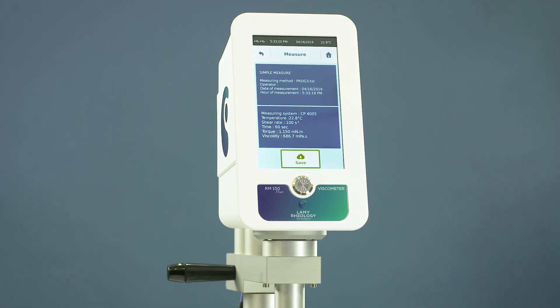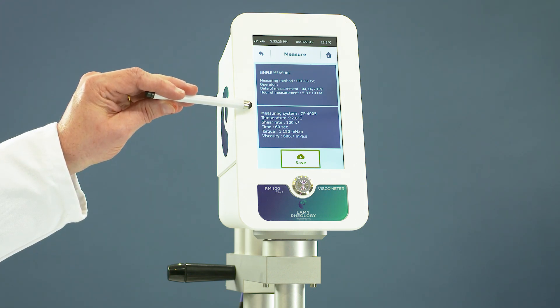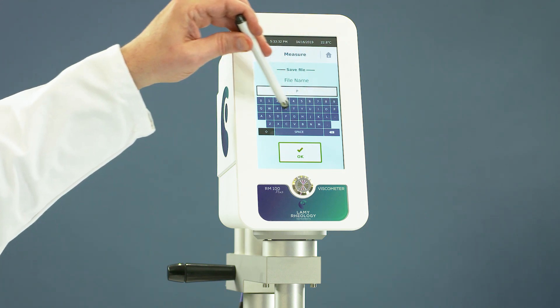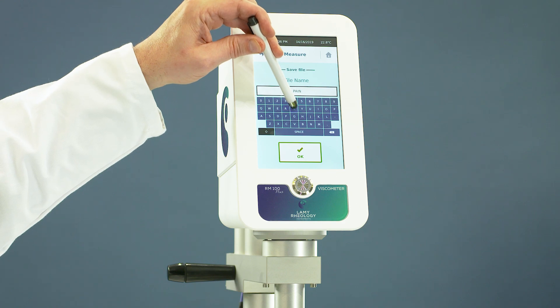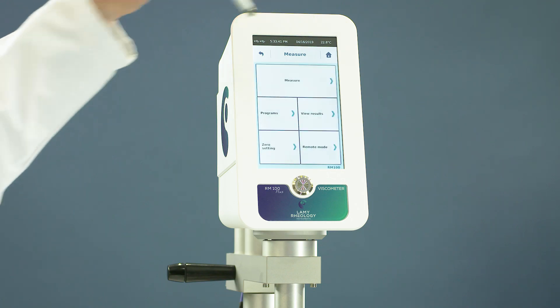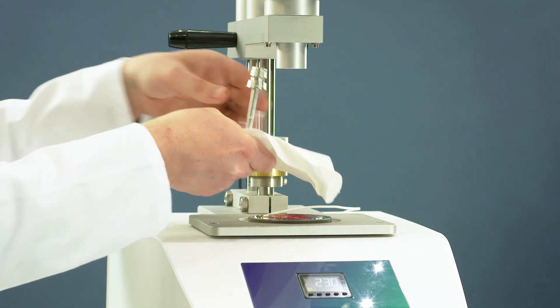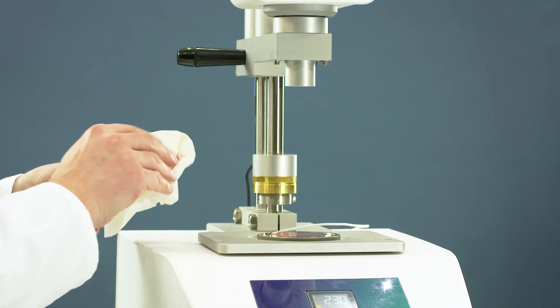At the end, the device shows all results obtained. You can save them. Remove the cone plate to clean it. As you can see, measurement with the RM100 CP2000+ is very easy.